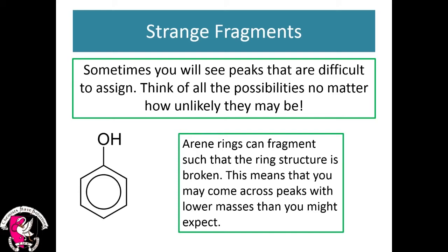In fact it can. This ring can actually break apart and no longer be a ring anymore, which means that you could find some peaks that have masses lower than you'd expect. If this ring was to break, it could then fragment further. So just bear that in mind, that rings can actually break in this bombardment of electrons.